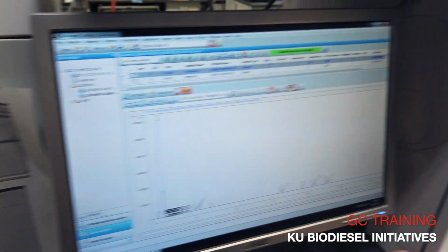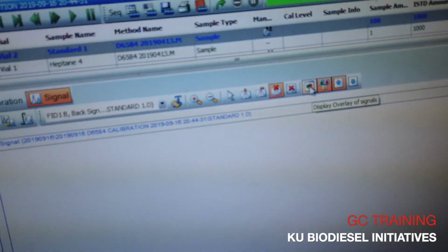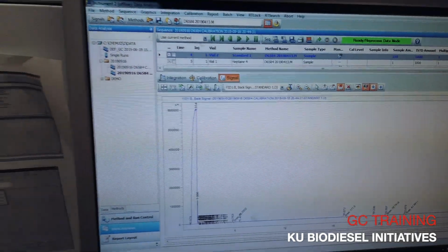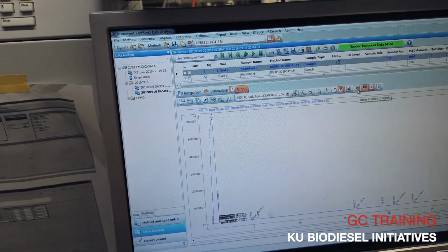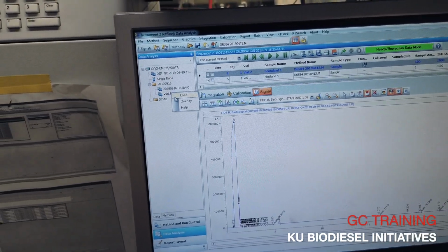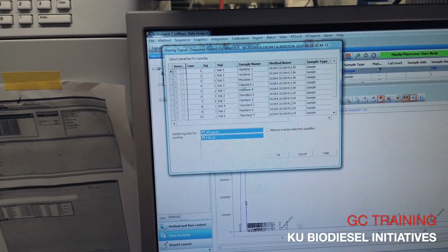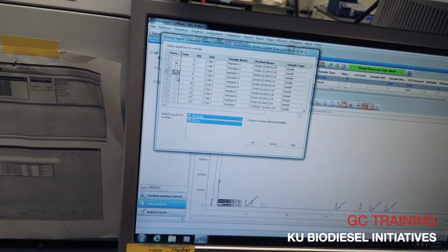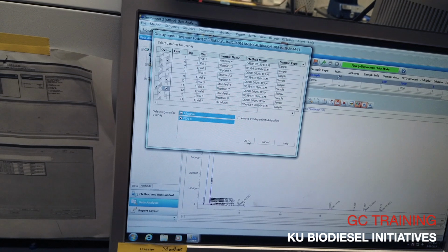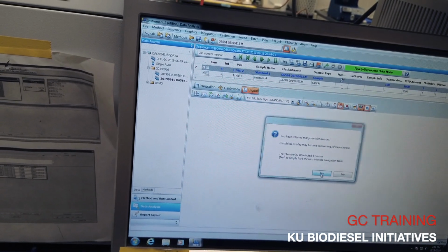So this is the separate overlay, and then this is the actual overlay of all four. So when you load them in, you want to have this one selected, because if you do it this way, it'll freak out, apparently. Okay, I don't care. Just do it.